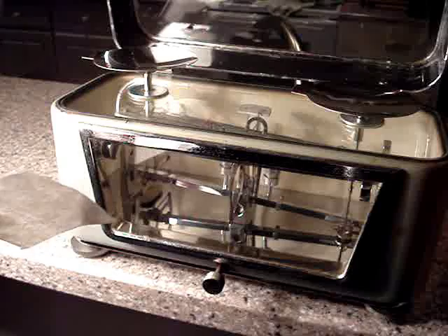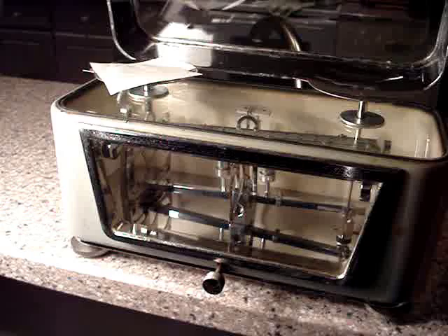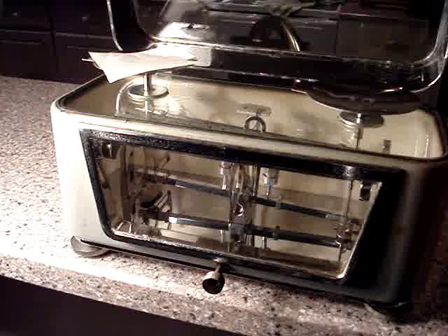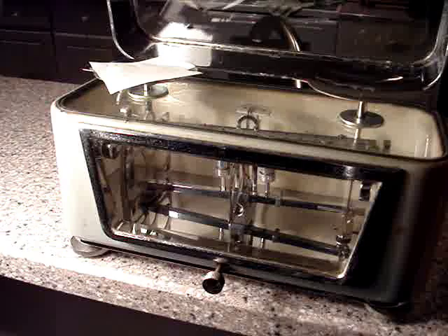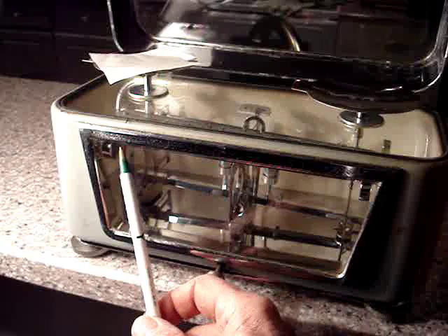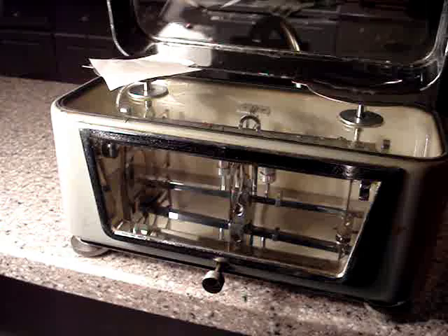Now I'm going to put it back on, and you can see the beams moving. They move very slowly. This is what the overall scale looks like — it's all chrome-plated in there, fine wall brass tubes. It's got six hair beams in there: two on the left — one lower, one upper; two in the middle — one lower, one upper; and two on the right — one lower and one upper.